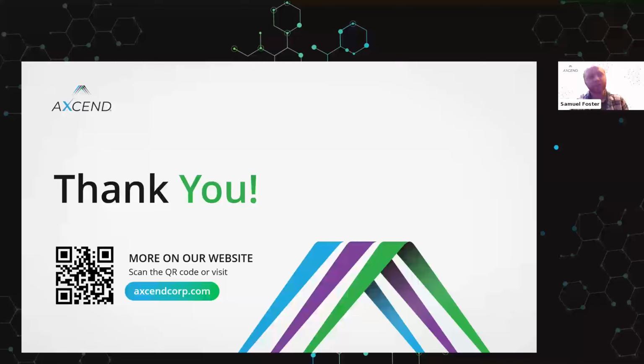Yeah, that's a great question. The answer comes in the evaporation process. So in APCI, you're typically going to be fully evaporated or nearly fully evaporated by the time you reach the ionization or that corona discharge needle. Whereas in ESI, you aren't going to be fully evaporated. And so a lot of that ionization efficiency comes from the difference in the evaporation process.